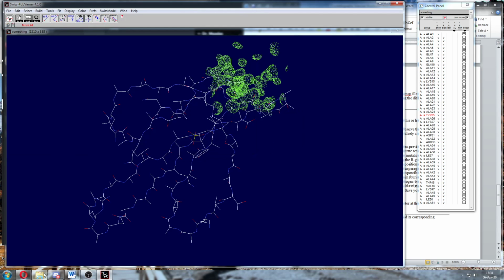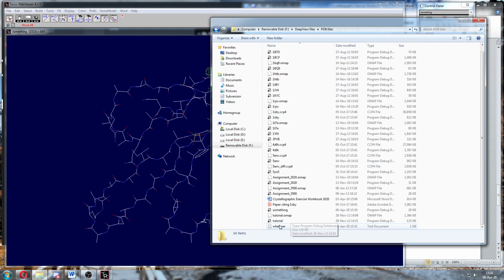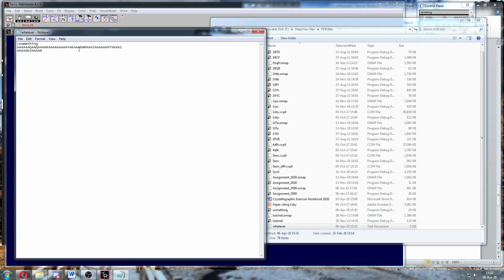All right. And if you go in that folder and open up whatever, it just gives me the list of amino acids. So you see we changed this number 25 here to tyrosine. There's the Y. And what I want you to do is, this won't say something, this will have your last name there, because that's what you called the file. I want you to grab all of this, including your name, including the caret, the greater than sign. Copy that, paste it in an email to me, and that's how you turn in this assignment. Once you've assigned all of them correctly.